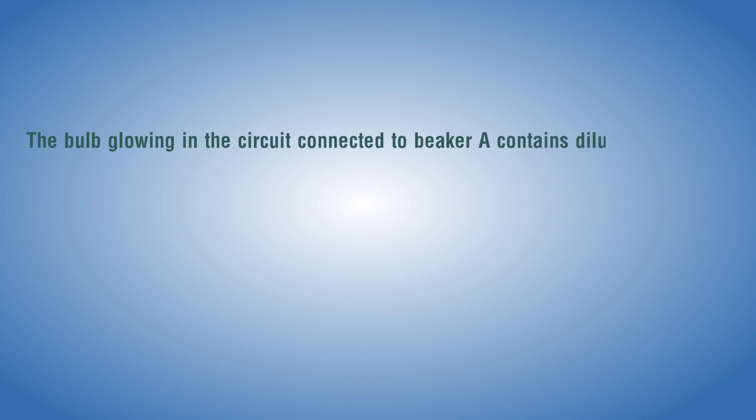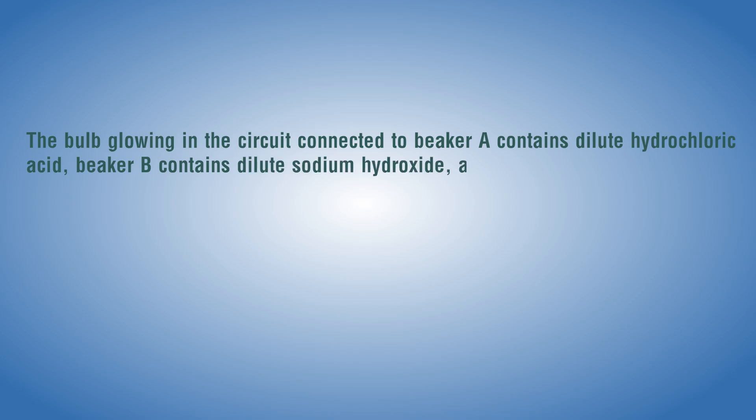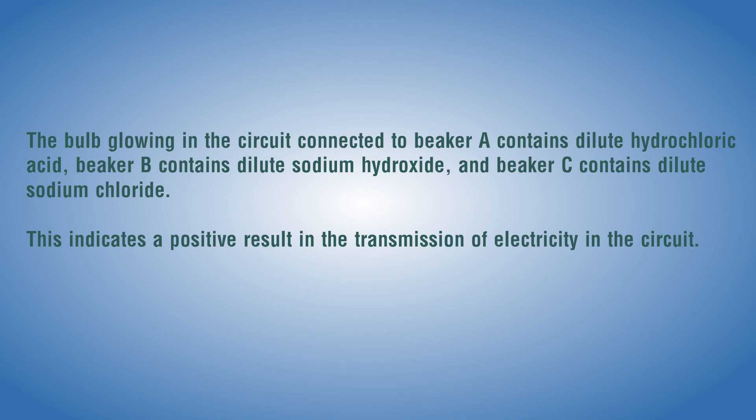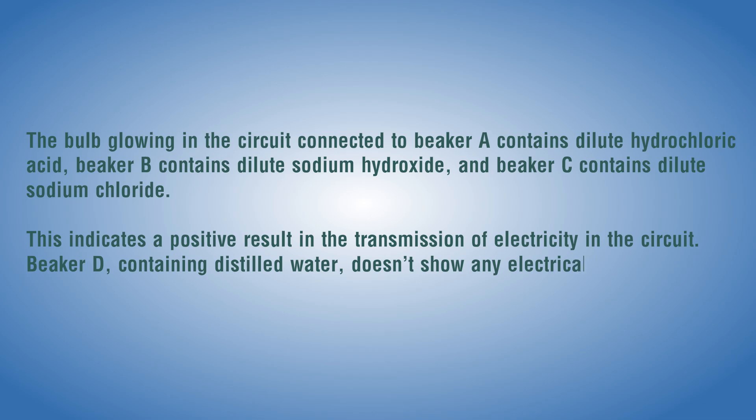Observation: The bulb glows in the circuit connected to beaker A containing dilute hydrochloric acid, beaker B containing dilute sodium hydroxide, and beaker C containing dilute sodium chloride — indicating a positive result in the transmission of electricity. Beaker D containing distilled water does not show any electrical transmission, so the bulb does not glow, indicating a negative result.